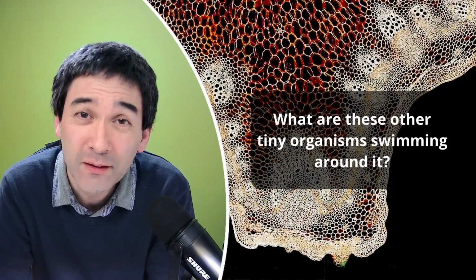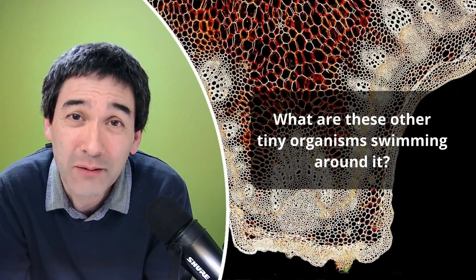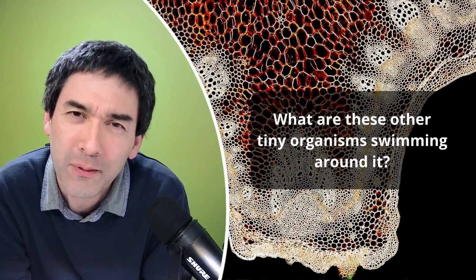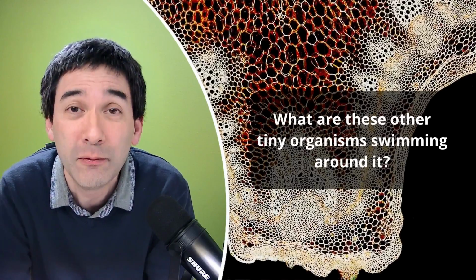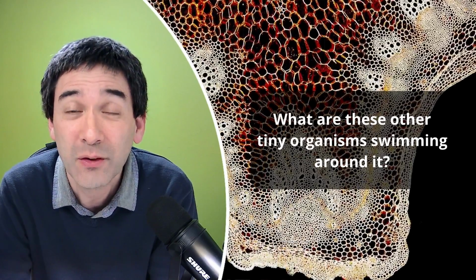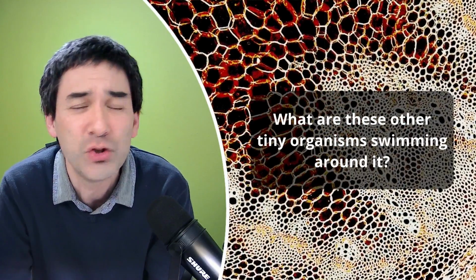Well, the short answer is I can actually only answer this question in a very general way, because I don't know what they are. Or do I? Well, it really depends on the level of depth at which you would like to identify these organisms. I can tell you already, those other things that were swimming around were also protozoans or protists. It's a very general category, right? Maybe you're still able to distinguish between ciliates and flagellates, or amoebae, right? But generally, to go any further in detail, you'd have to dive in much more.